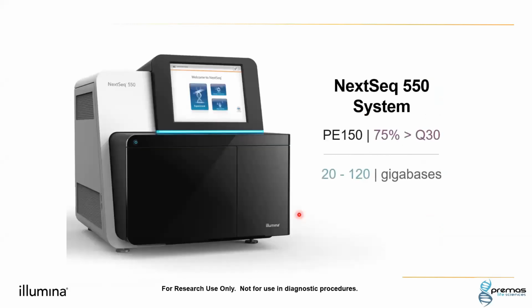Now let's move on to NextSeq 550. This is basically a big upgrade. From 15 GBs, you move on to 120 GBs, and the reads here are 400 million reads.